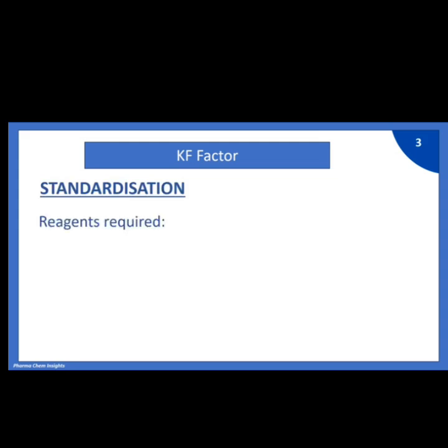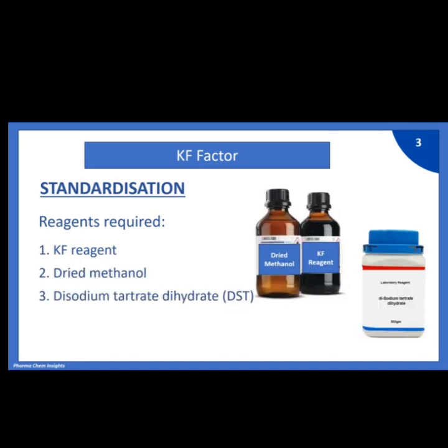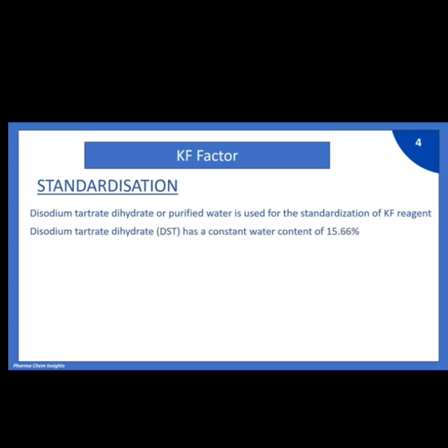The reagents required for Kf factor are Kf reagent, dried methanol, disodium tartrate dihydrate (DST), and drying agents, for example molecular sieves or silica gel if necessary. Disodium tartrate dihydrate is used for the standardization of Kf reagent. You can also use purified water for standardization of Kf reagent.